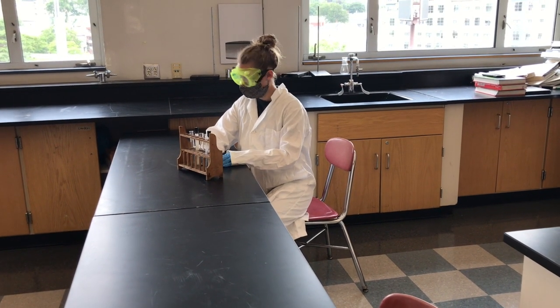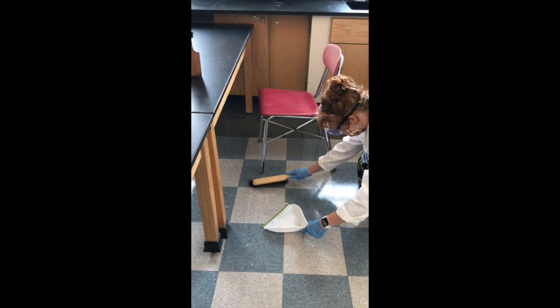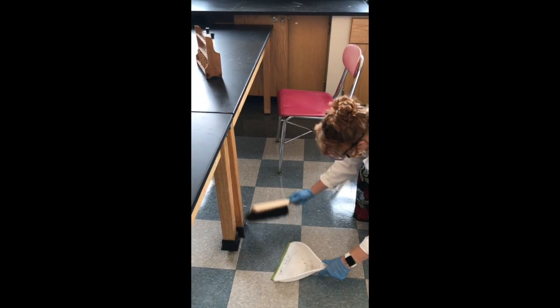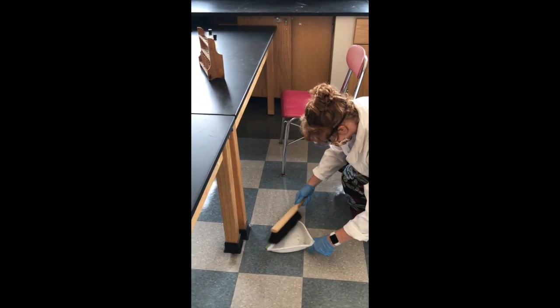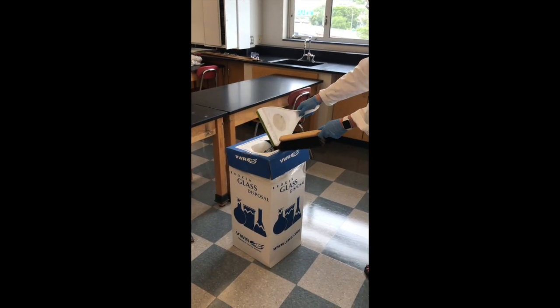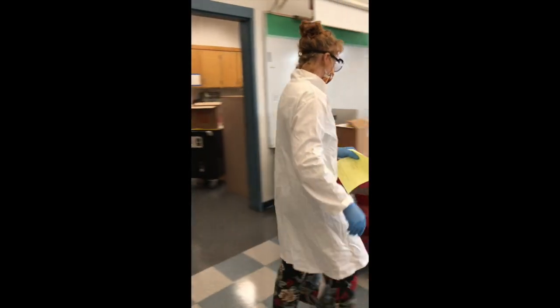As you can see, a glassware incident occurs. The teacher is notified and cleans it up immediately following the correct procedure. And then after following that procedure, we'll file an incident report, which should be located at the front of your classroom.